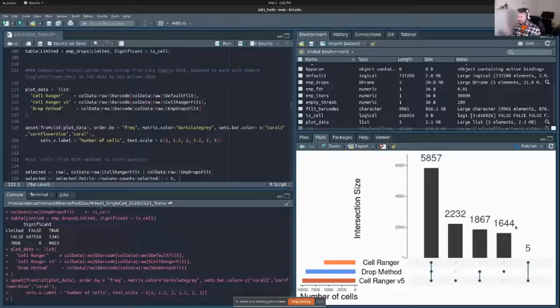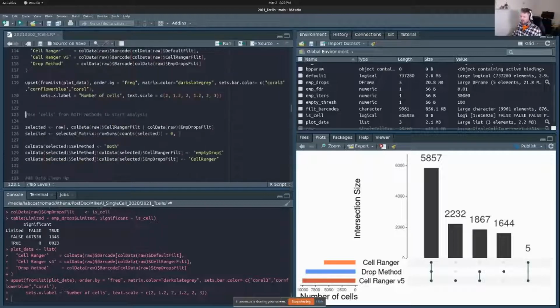So what we're going to do is take all of them. We don't want to miss important cells, especially if they have really rare subtypes, right? Maybe Cell Ranger's algorithm for gene expression doesn't suit your experimental type. Maybe your treatment is different. Maybe you're using weird cells that no one's ever discovered before, and you don't want to lose those because they didn't match some predetermined algorithm. So what I do is I take all of them. It's going to be more cells than are probably going to be there, but they're going to get ruled out once we remove dead ones and other stuff like that.